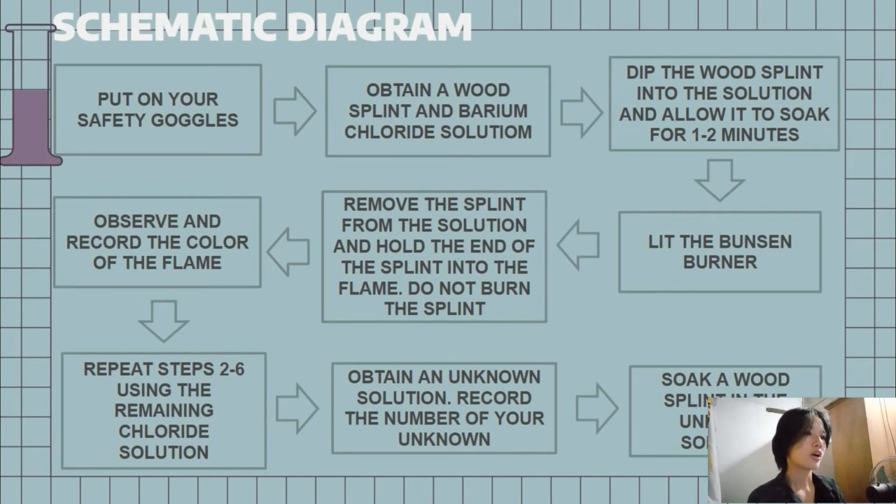And then, after that, obtain an unknown solution, and then record the number of your unknown. After that, soak na pud ka ulit sa imuhang wood splint sa unknown solution. So, mao lang to siya, very easy, diba?